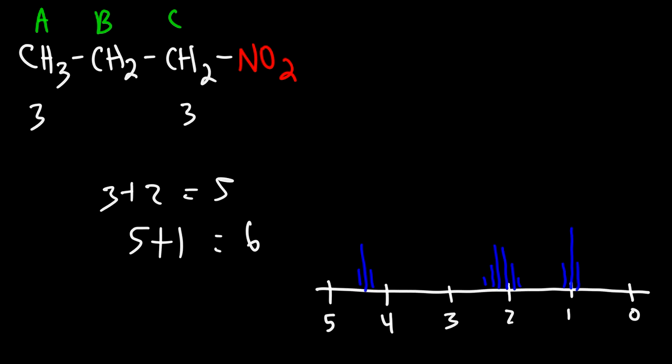It's important to understand that this is not the most accurate way to get the multiplicity for this type of proton when there's 2 different types of protons adjacent to it. In most cases, it will suffice, as you can see that proton B has to correspond to this one, but it's not the best way. It's not the most accurate way of doing it.